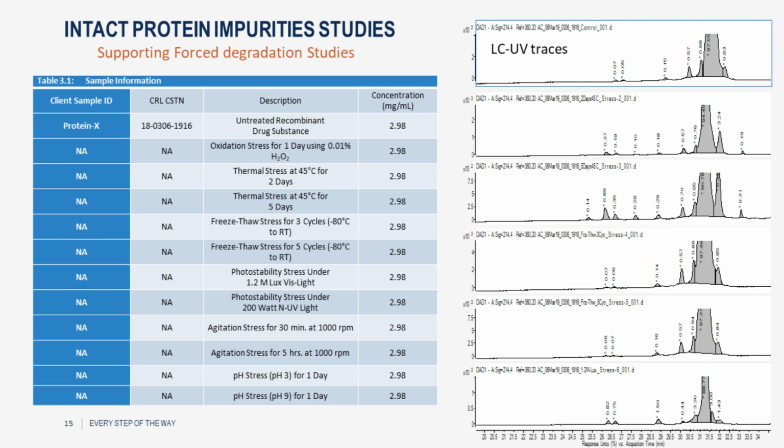Even the drug substance itself did have small amounts of various impurities in it. And so the goal here is to just characterize what all those peaks are. What are all those impurities in the various chromatograms? And again, the way to solve this is to just have an HPLC method that's fully mass spectrometry compatible, so that it can simply be then run into both a UV detector as well as the mass spectrometer.